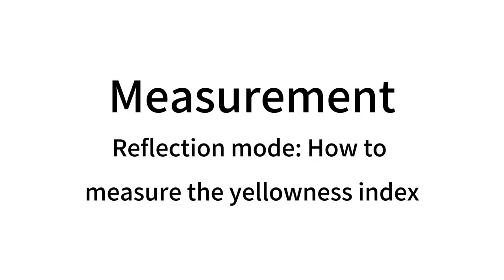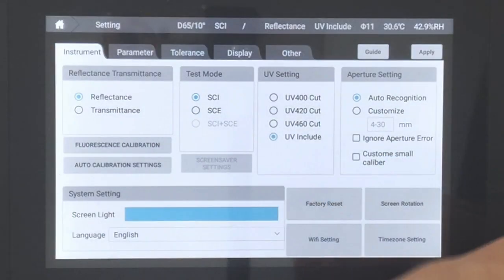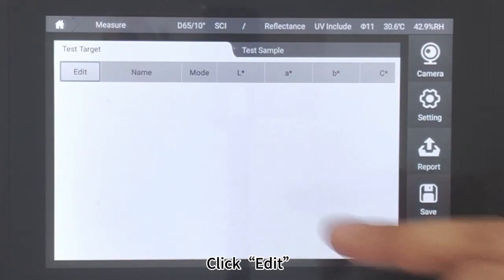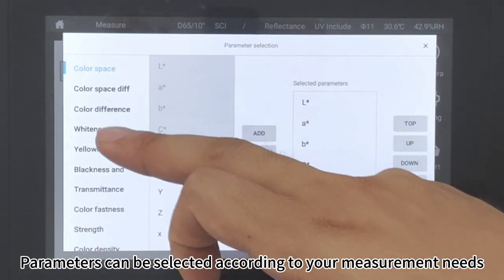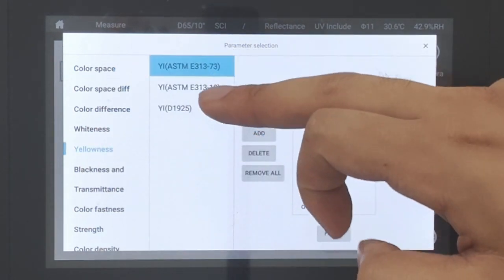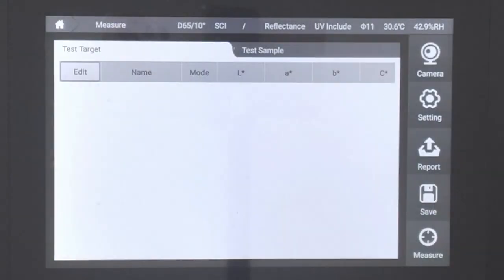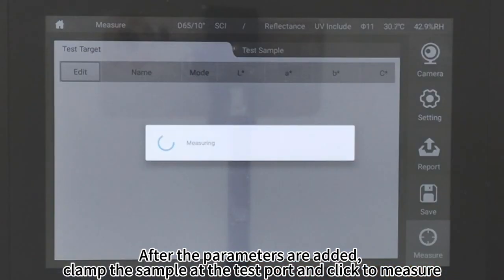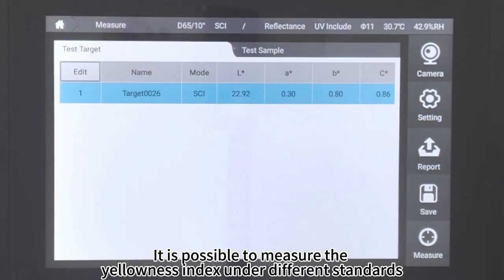Reflection Mode. How to measure the yellowness index: Click Setting, then click Display Data and click Apply. Click Edit — parameters can be selected according to your measurement needs. After the parameters are added, clamp the sample at the test port and click Measure. It is possible to measure the yellowness index under different standards.